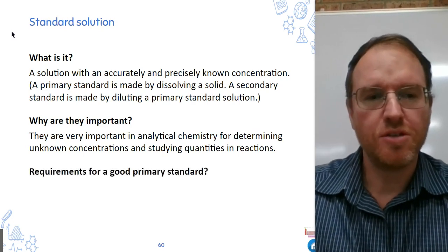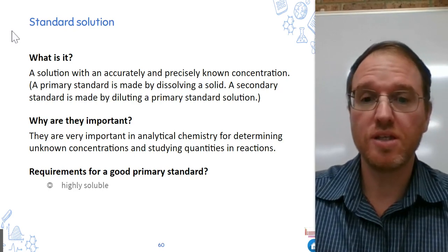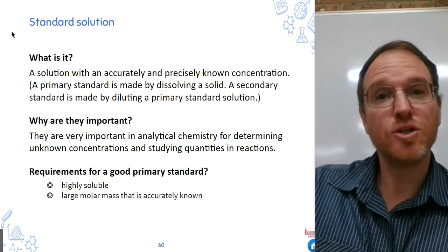What are the requirements? You can't just take any substance and use it to make a primary standard solution. So these are some of the requirements. It's got to be soluble. That's obvious because we're going to prepare a solution. You want a large molar mass.